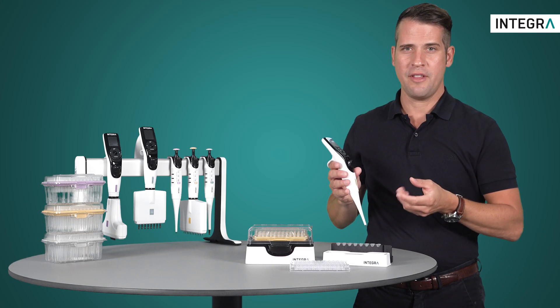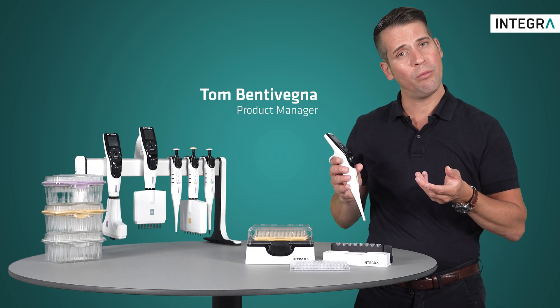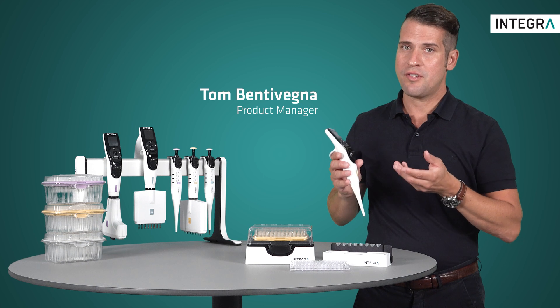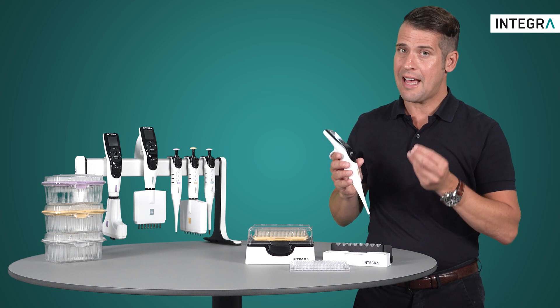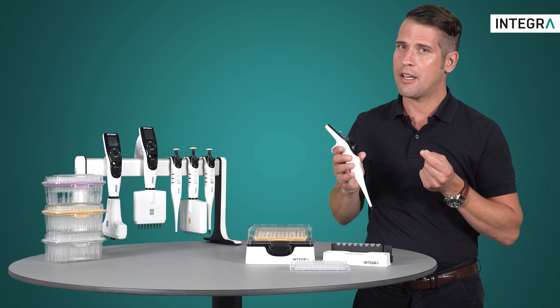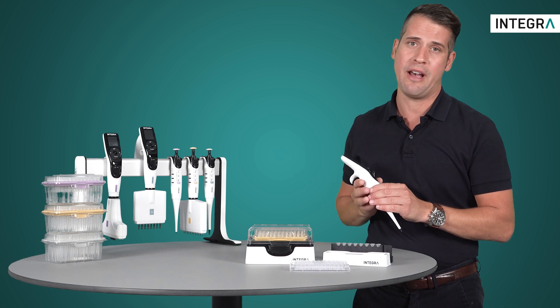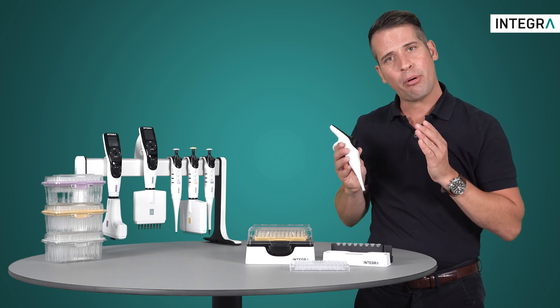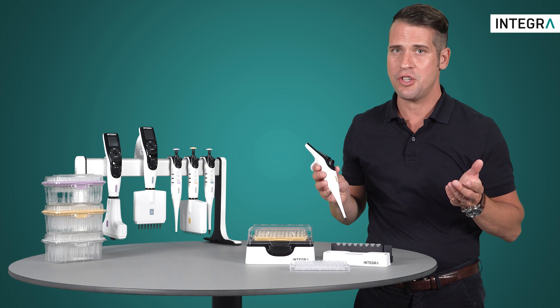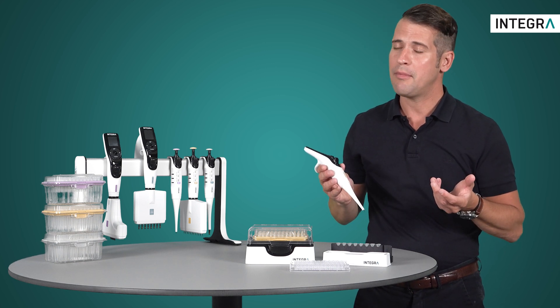An extremely useful feature of the electronic pipettes from Integra is the mode known as manual mode. This mode is used if you don't know the exact volume you want to aspirate, or if you want total and complete control over your aspiration and dispensing, much like you would have with a manual pipette. This is the perfect mode for carrying out titrations, measuring unknown volumes, collecting supernatant, and much more.